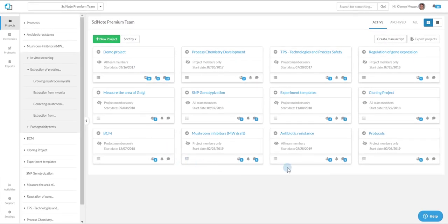That is all for this tutorial on project dashboard and sorting. If you would like to learn more about other SciNote features, we invite you to watch our other tutorials.